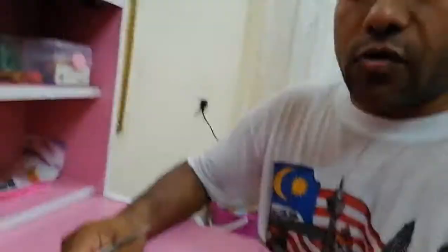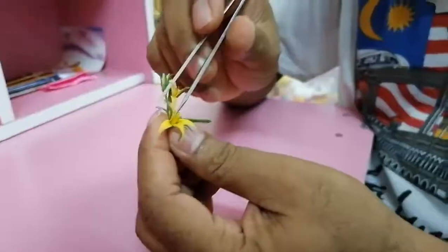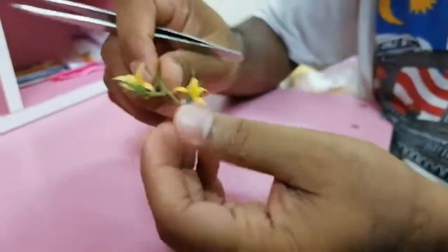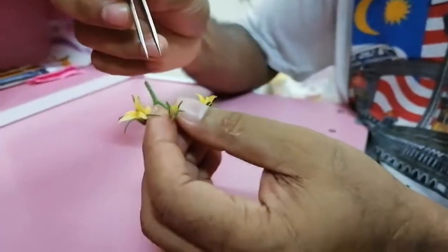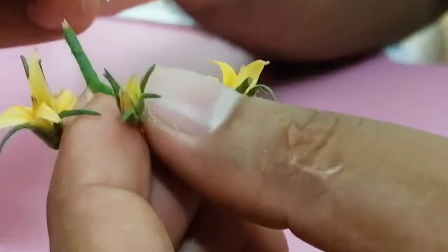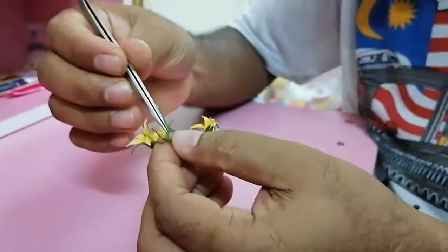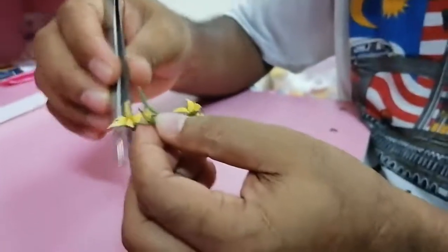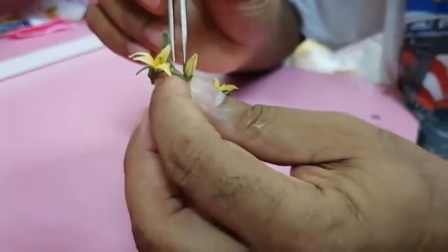Now I'm showing again how to emasculate a tomato flower. These two flowers are already open so we cannot emasculate them — they have already completed pollination. We have to emasculate flowers that are supposed to open tomorrow. I've collected some such flowers. First, one by one, we have to remove the sepals very carefully.